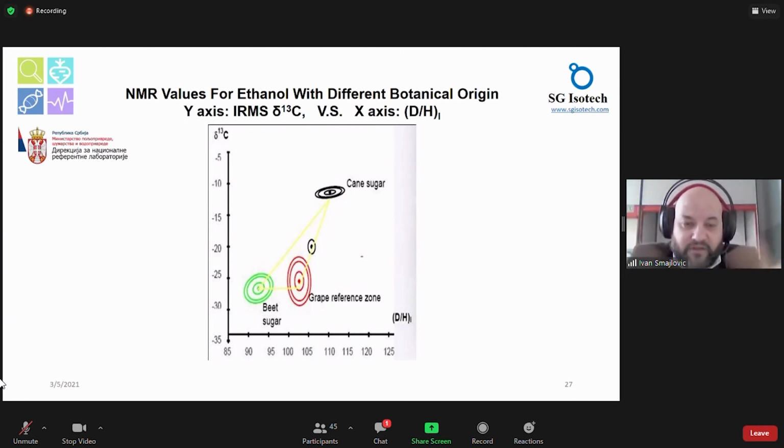Now, they are not taking just deuterium from the ethanol, they are taking carbon, and they are taking oxygen from the wine water. So they have a list of 4 or 5 different isotopes from the same matrix, and they say this is the fingerprint. And it is very tough for counterfeiters to make this fingerprint look the same as the original.